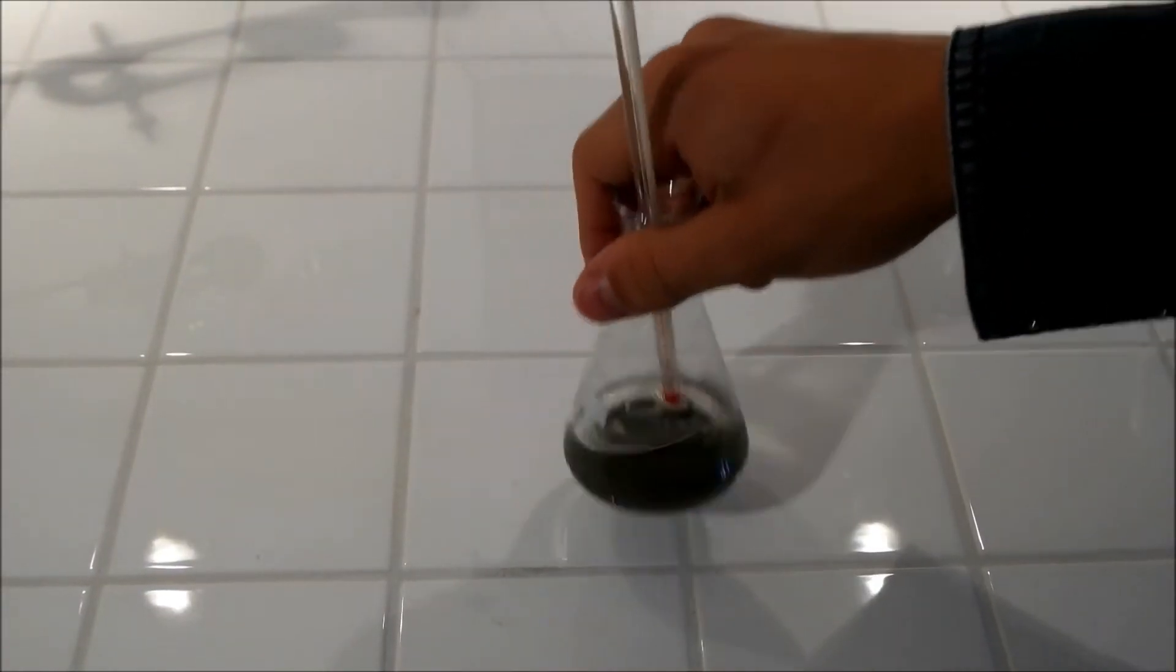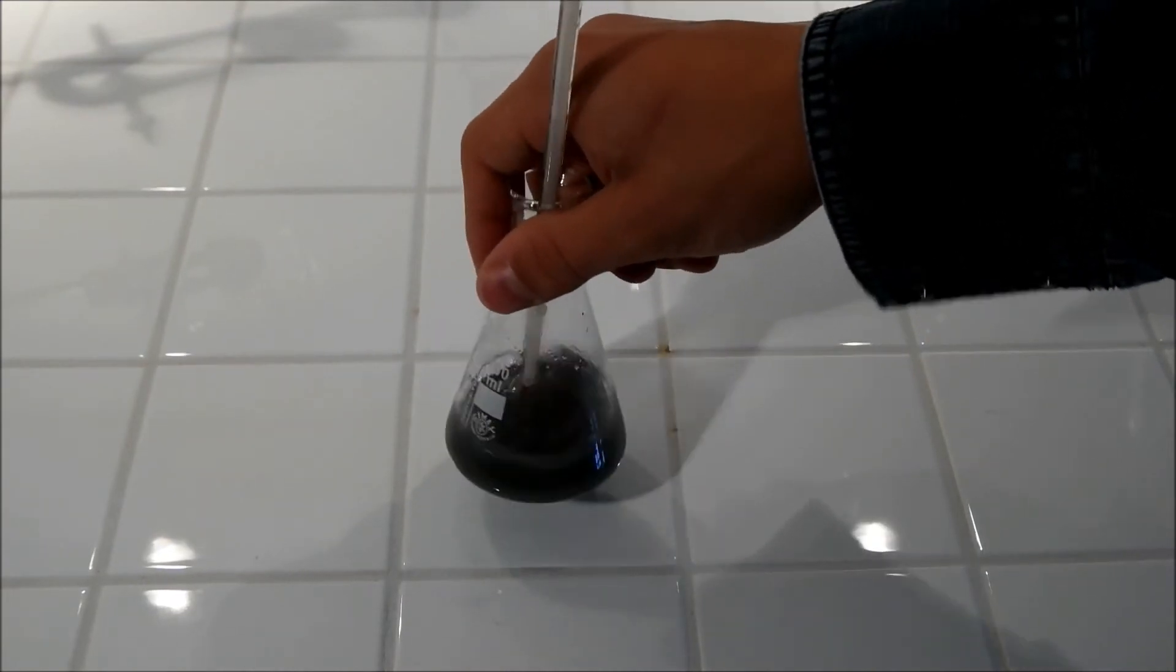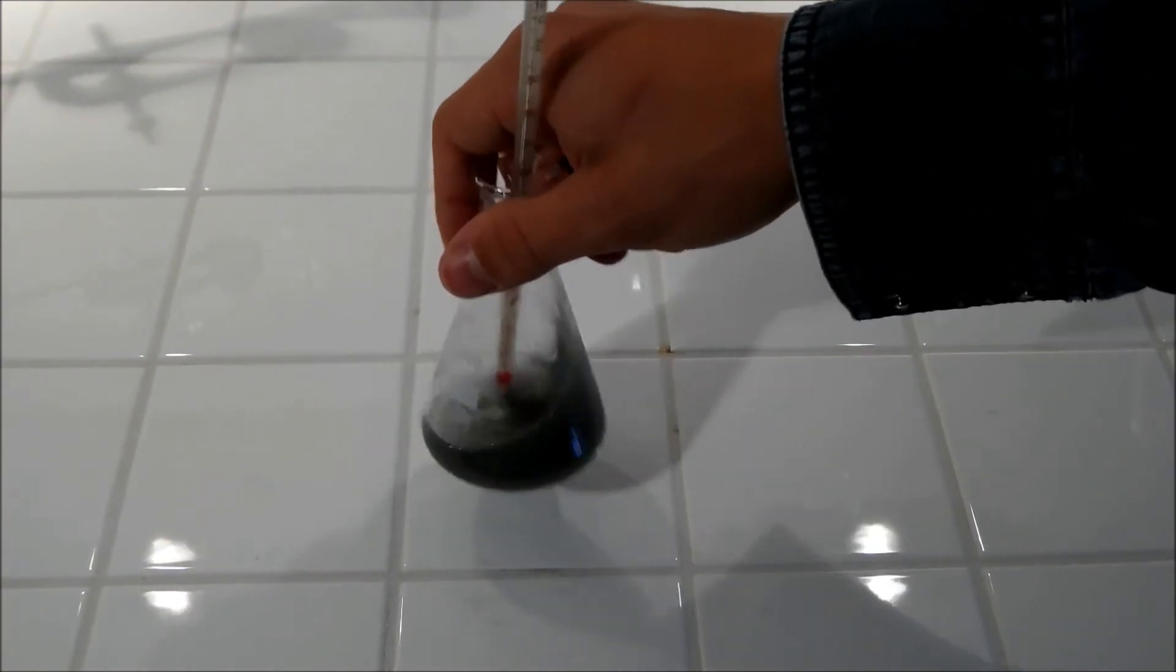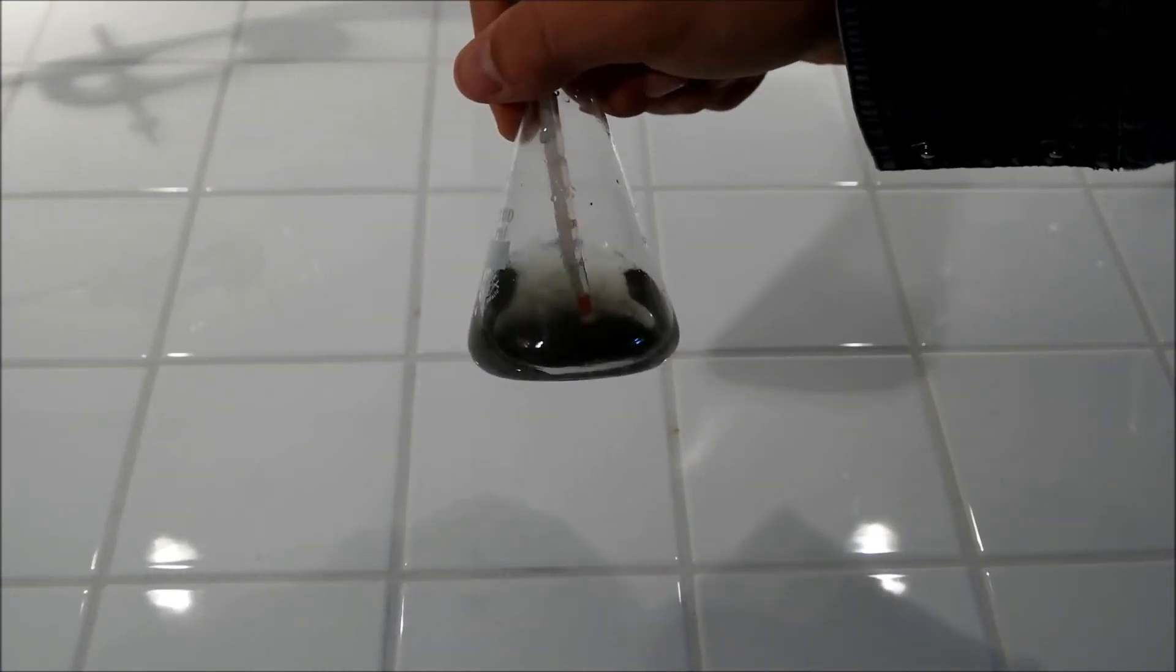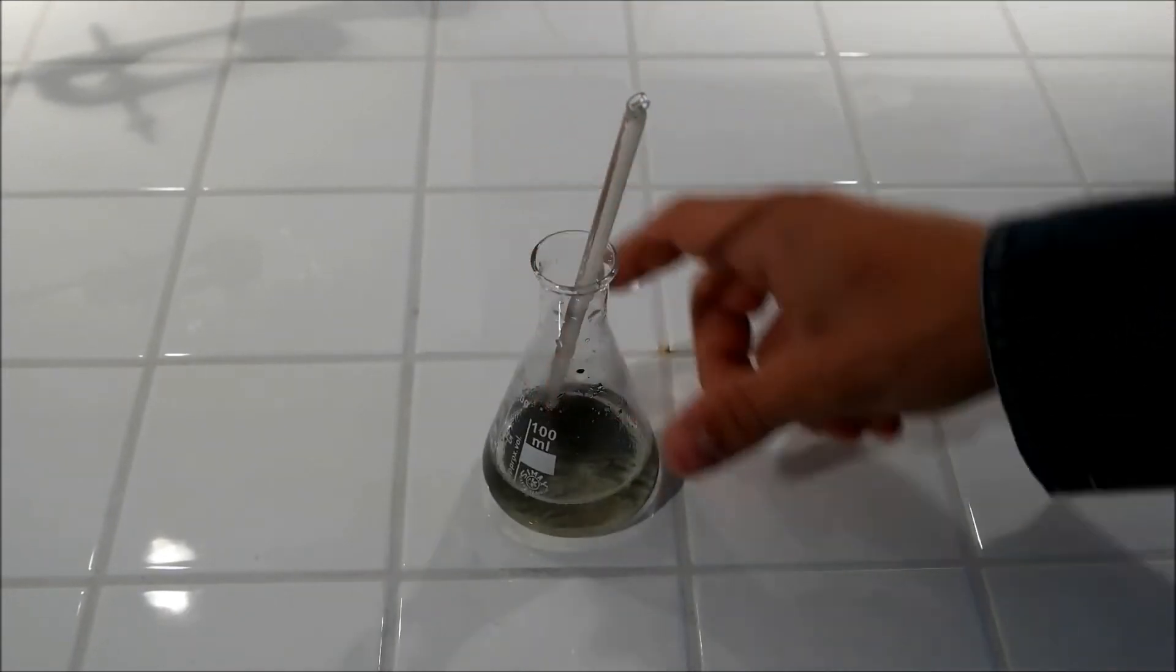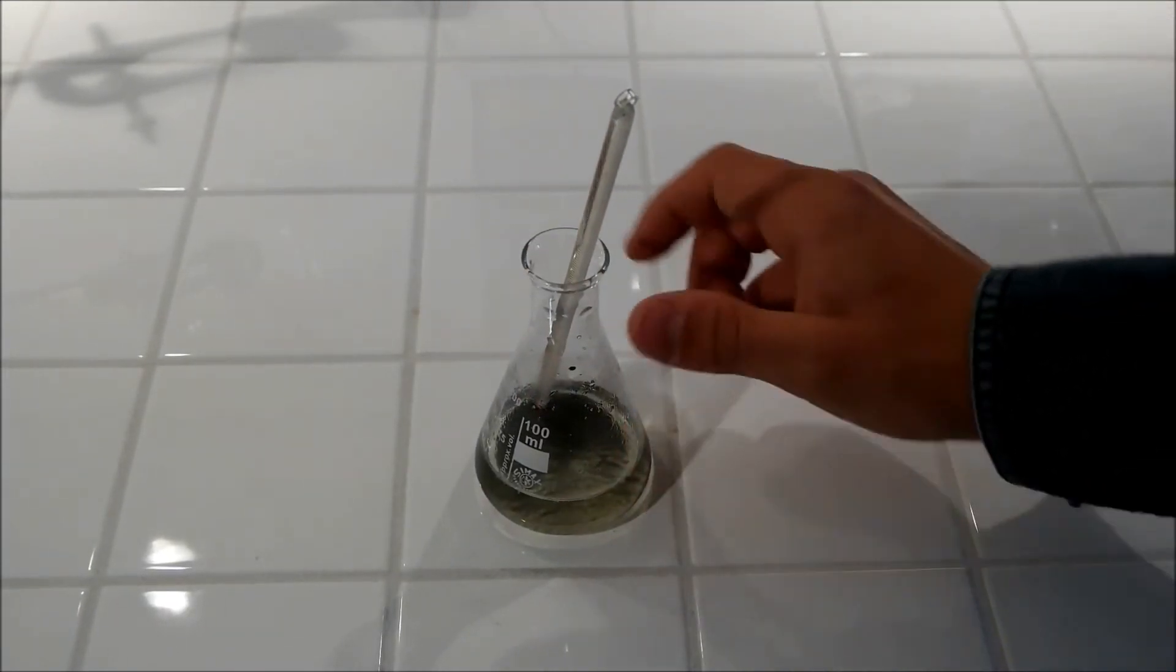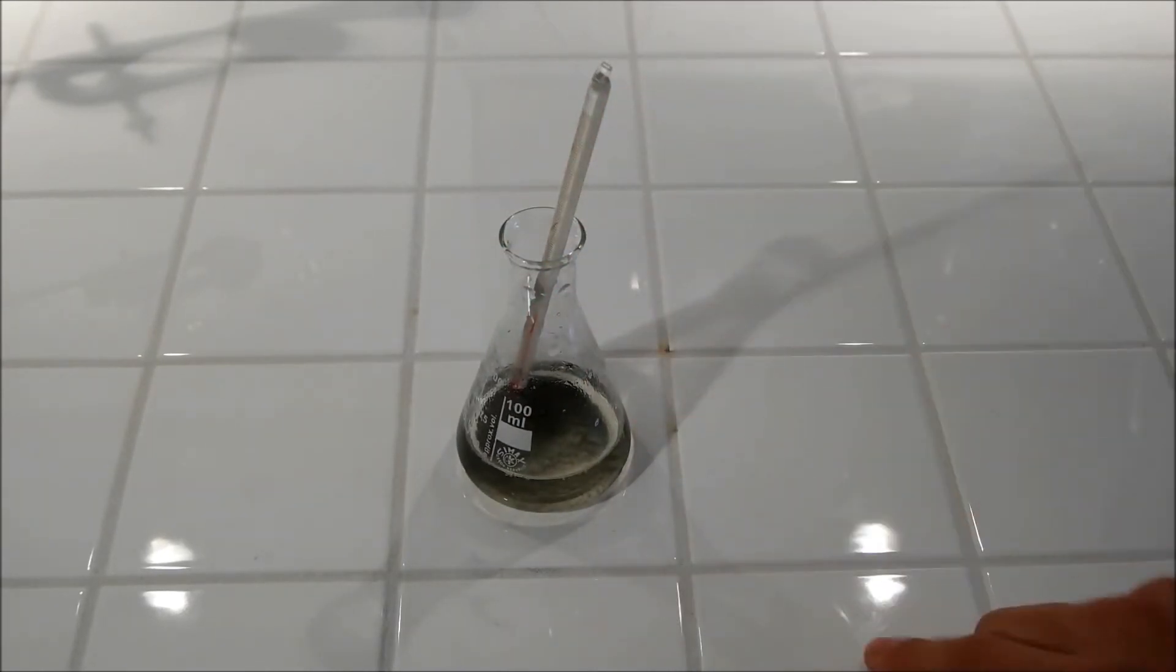After some time of stirring this, the brown orange color will disappear and this only looks like water with a powder on the floor. And later we will pour the fluid in our u-tube and keep the powder in the Erlenmeyer flask.